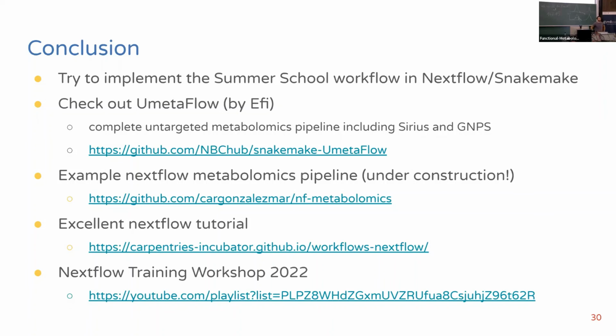How easy is it to connect to APIs, particularly thinking about GNPS or maybe SIRIUS? Kai made a comment that it's even possible to launch CSI:FingerID directly from a Nextflow workflow? It's very easy, actually. You could run SIRIUS in headless mode, using the command line interface, and make a process for that with the script and put in your input files.